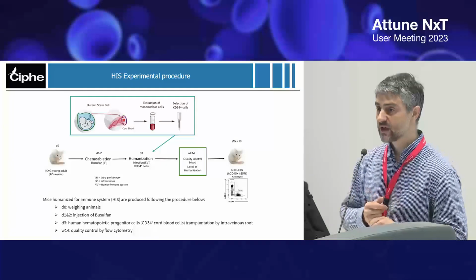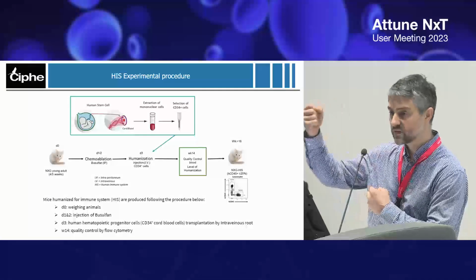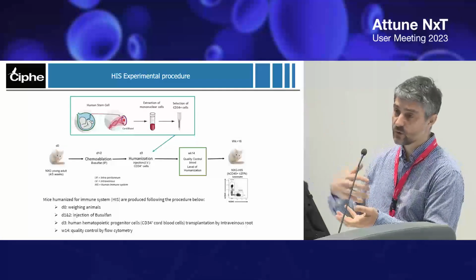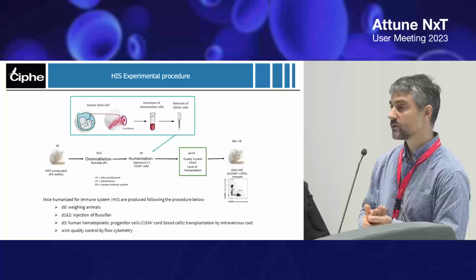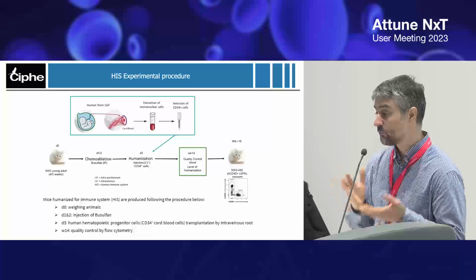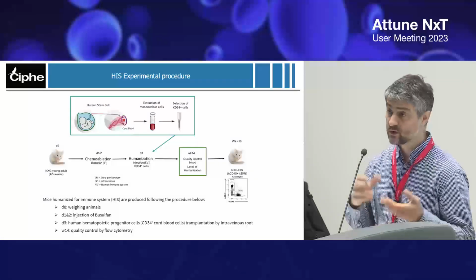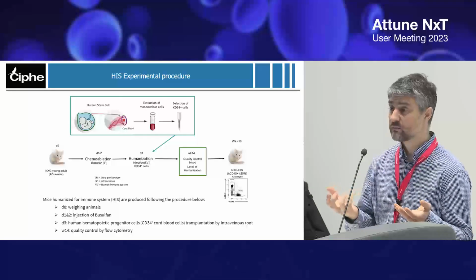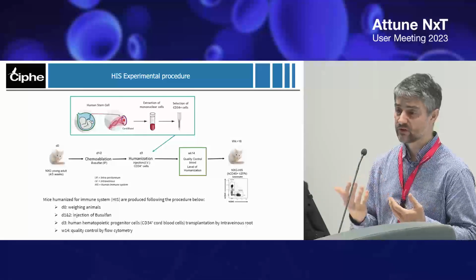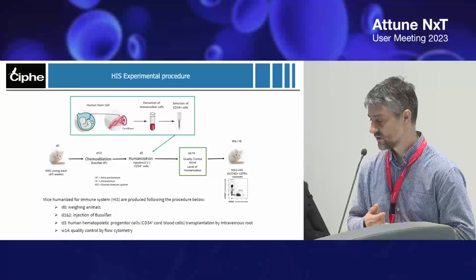The issue with this Ficoll approach is that you want to count the number of human cells, that's correct, but you also have mouse cells, right? What you want to identify is animals that have the best percentage of human cells over mouse cells. And when you do Ficoll, you just deplete mouse cells, so you bias your results intensely, and we have also seen that we bias the phenotype.